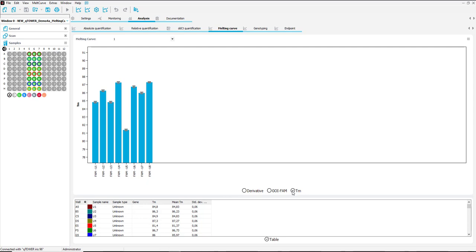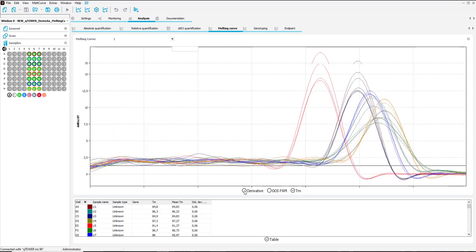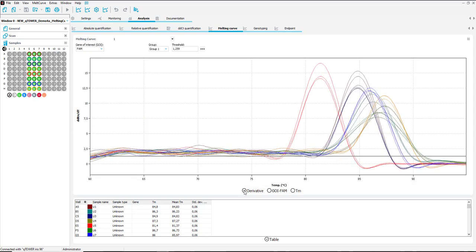Once the analysis is complete the results can be exported in a number of ways. Right click on the graph and click copy chart to copy the graph image or select save chart to save the CSV file which will save the raw data of the fluorescence measurements.